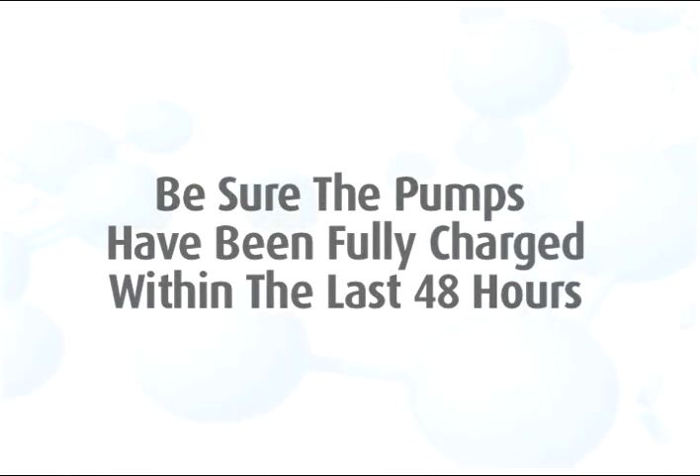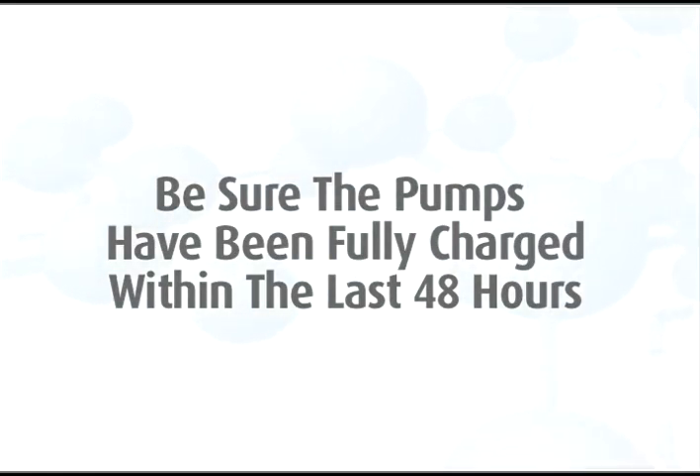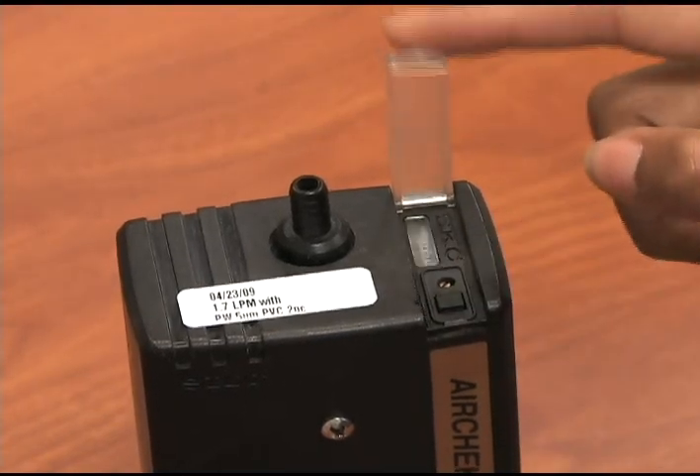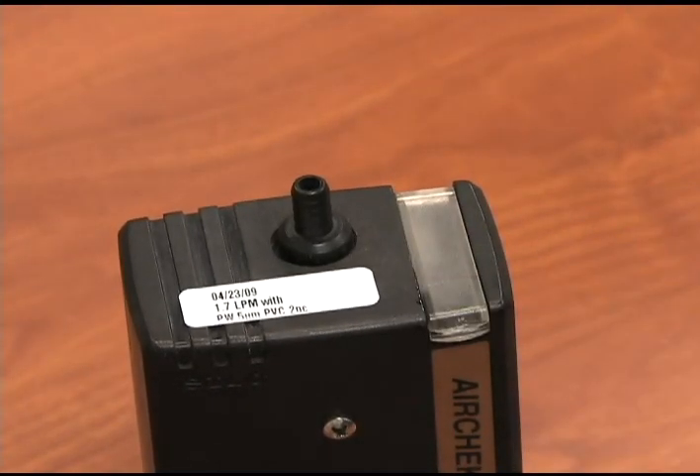To calibrate a pump with a 10 millimeter cyclone, first be sure the pumps are charged. If the pumps have not been charged within the past 48 hours, you must recharge the pumps prior to sampling. Start the pumps so they can be warming up — they need to run at least three minutes before you begin the calibration. Be sure to verify the pump flow rates in an area where you are not exposing the media and equipment to the contaminant, like an office setting.